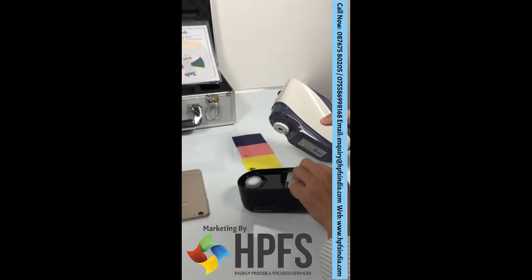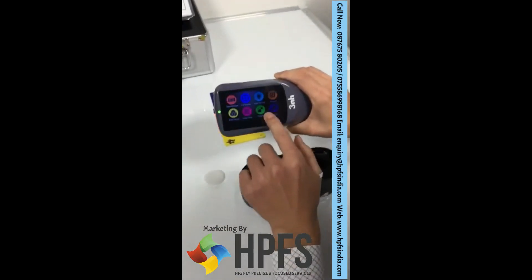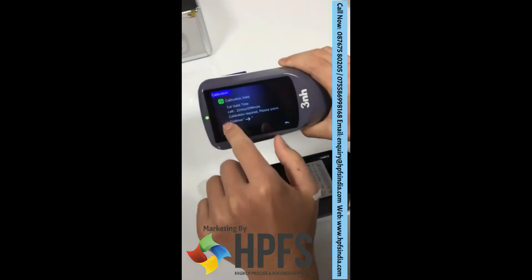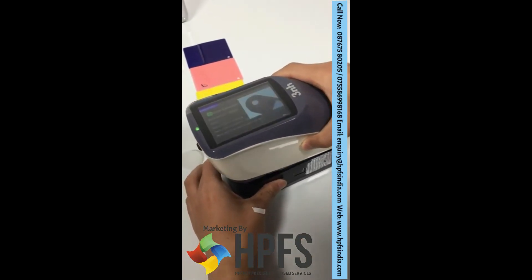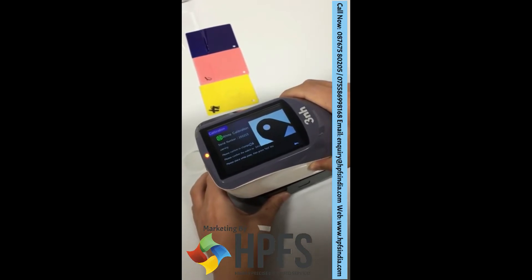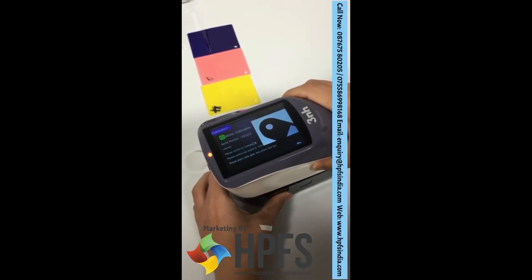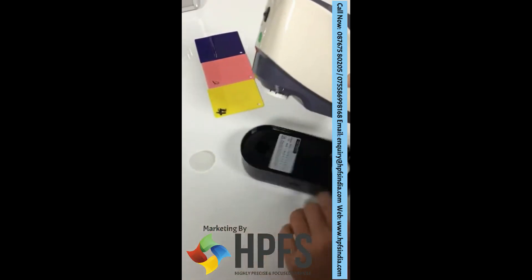First, calibration. White calibration, then black calibration.